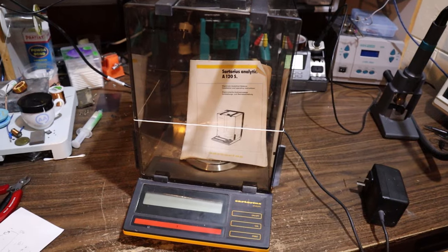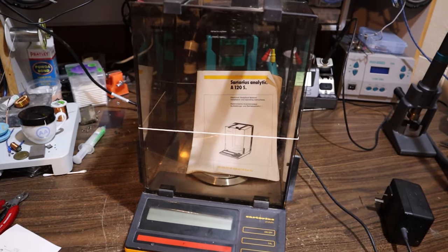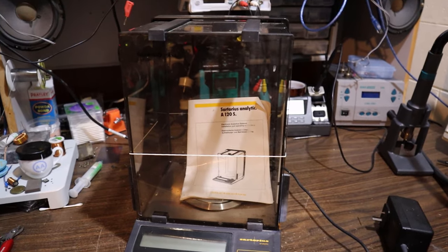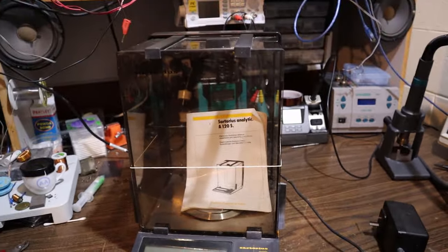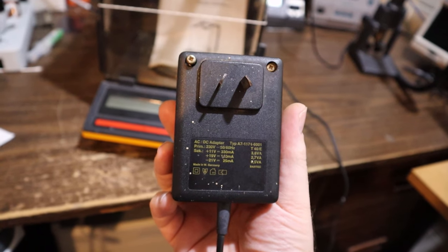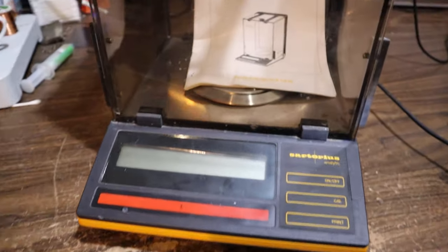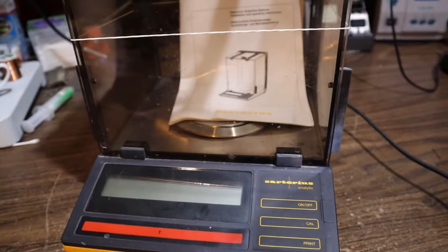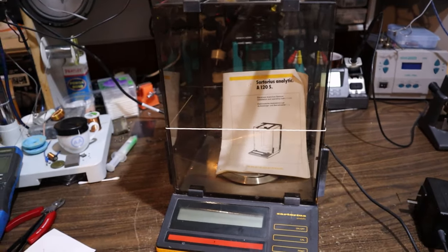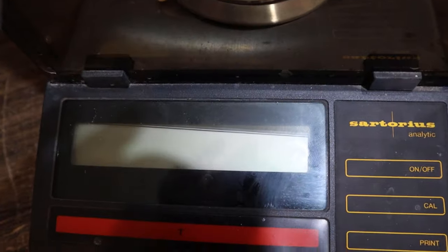Hello again. Today we're looking at a Sartorius analytic brand analytical balance, designed to measure very precise small masses down to micrograms. This one doesn't turn on. If I plug in the adapter, which has one 11-volt rail, one at 19, and one at negative 21 volts, we get that really horrible noise. It doesn't sound good at all. I'm wondering if the power supply is not capable of supplying the current demands of this unit.